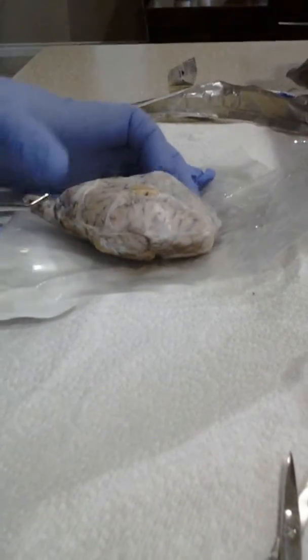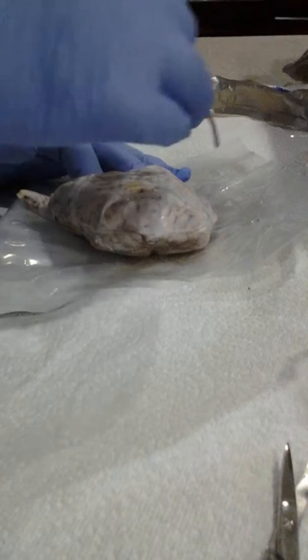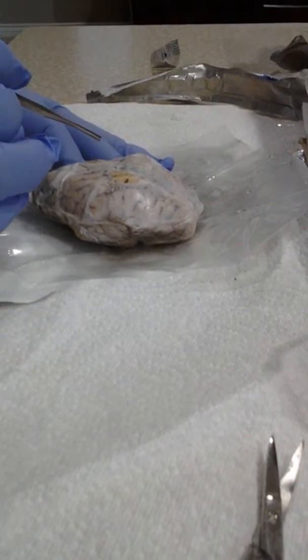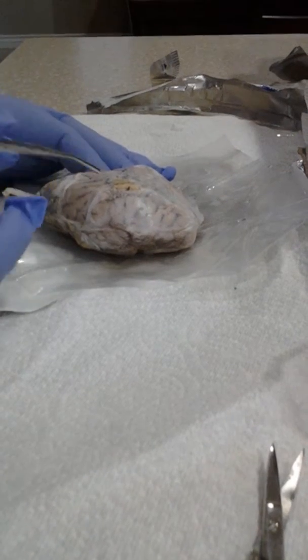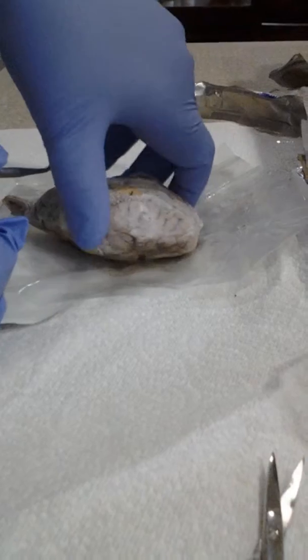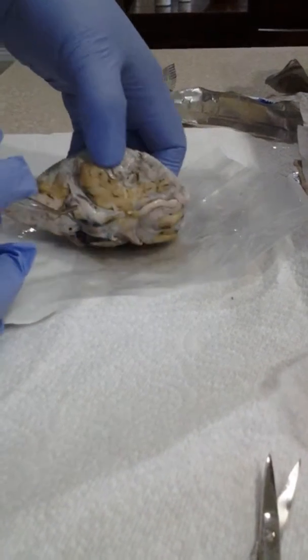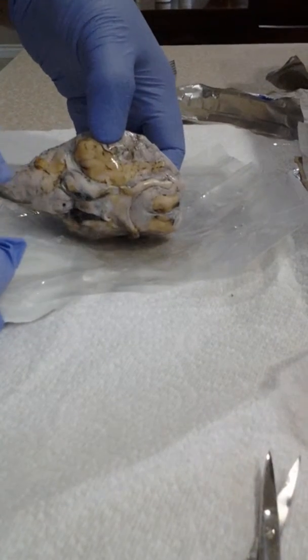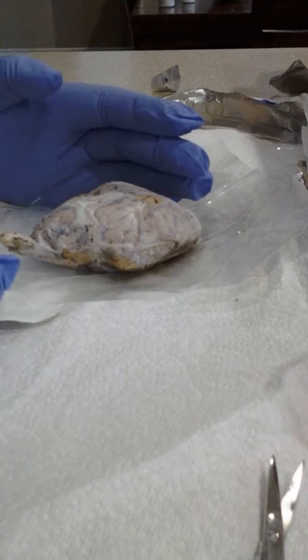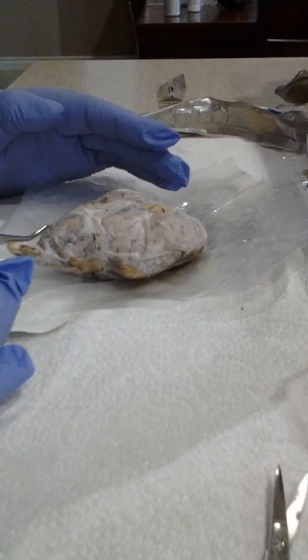Starting with the parietal lobe here, you have the frontal lobe on this side, the temporal lobe just below, you have the occipital lobe on this side, and down under here you have the brainstem, and over here you have the cerebellum. The cerebellum is for balance, coordination, fine muscle control.